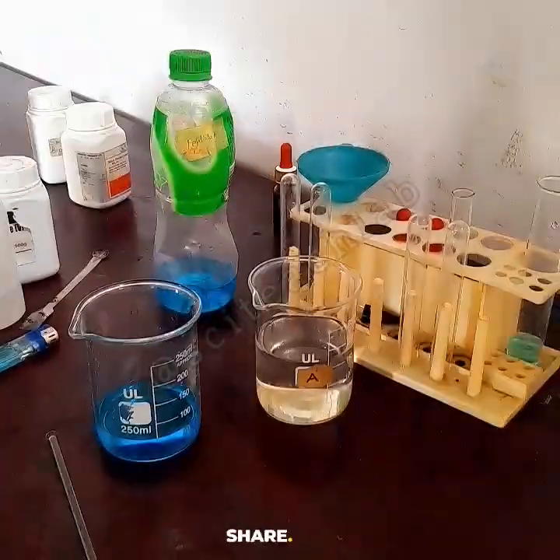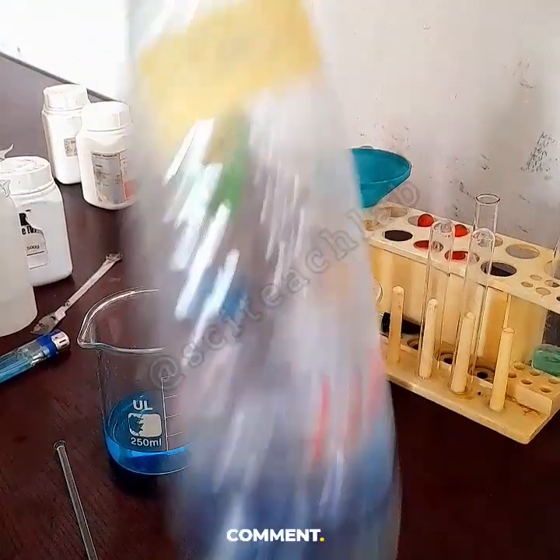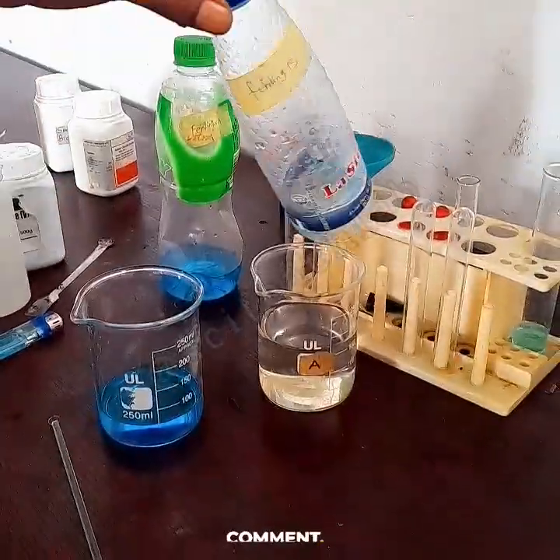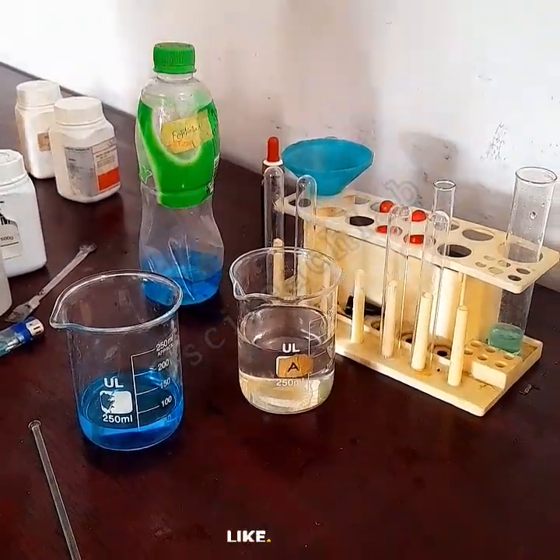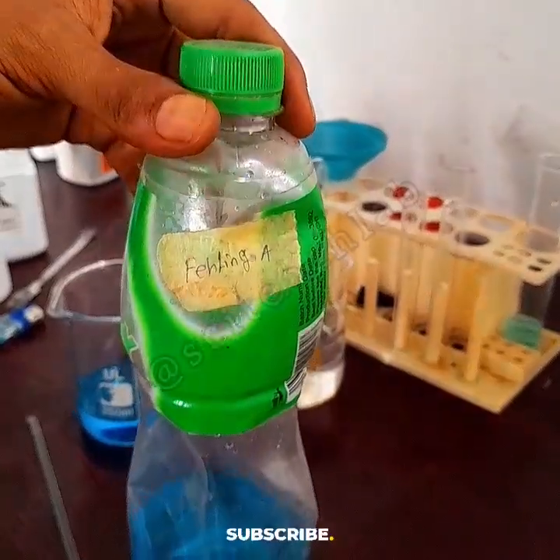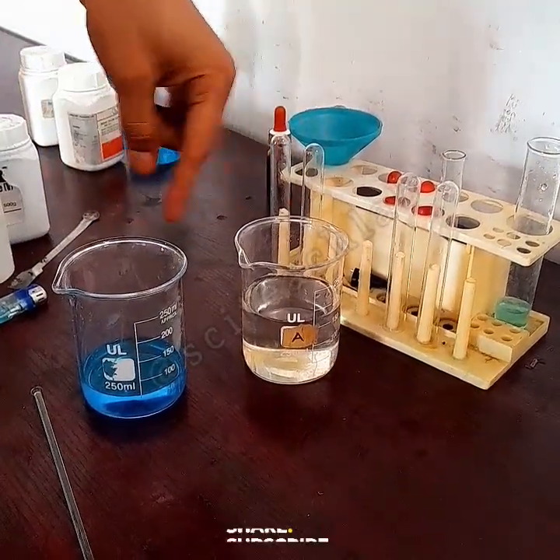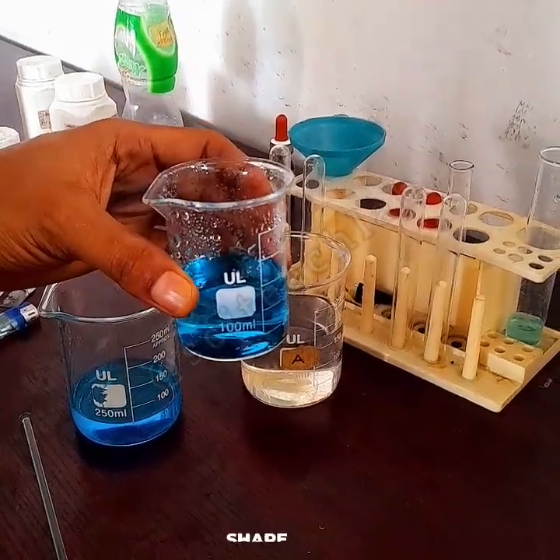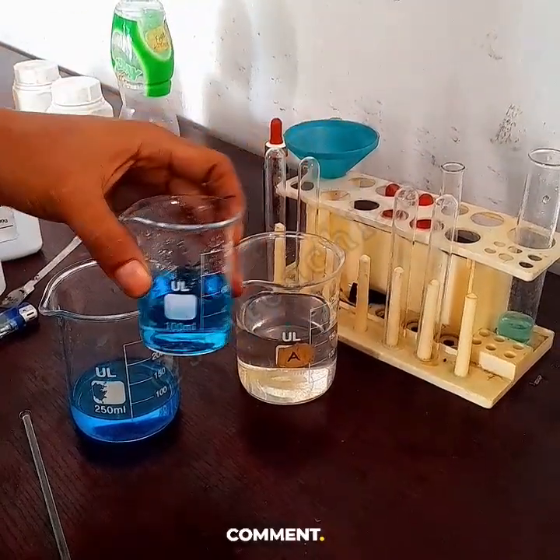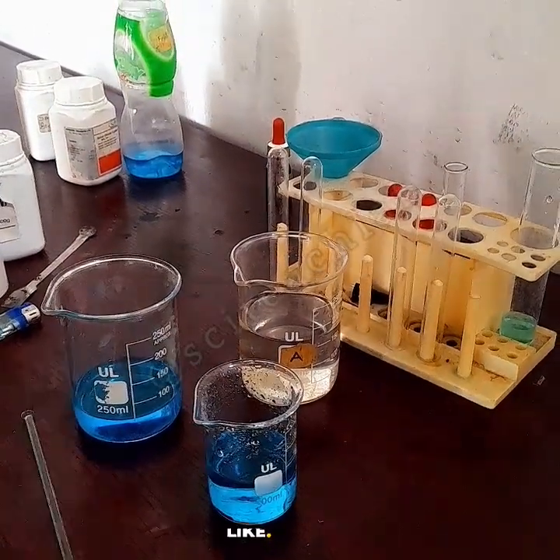That was the beaker for the acid I used earlier. This is the Fehling's B I poured out into that beaker that's labeled A. So the transparent one is Fehling's B, and the blue one is Fehling's A. We need these. Now I'm going to mix these two proportionally to form the Fehling's solution. So I mix them up and form this one in a smaller beaker, which is my Fehling's solution.